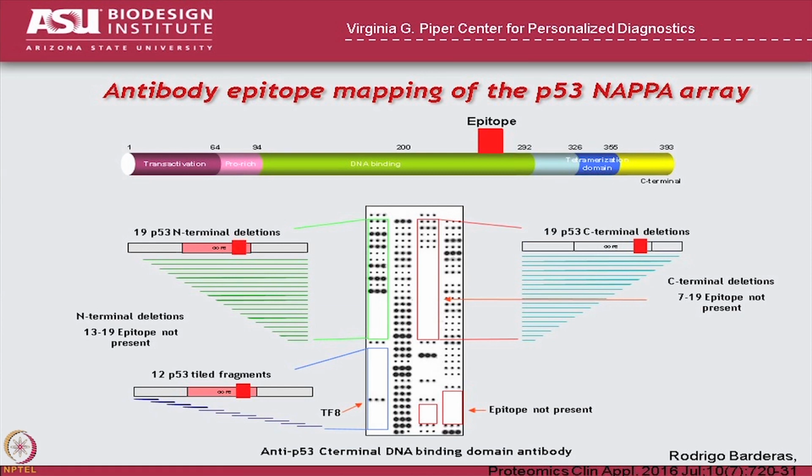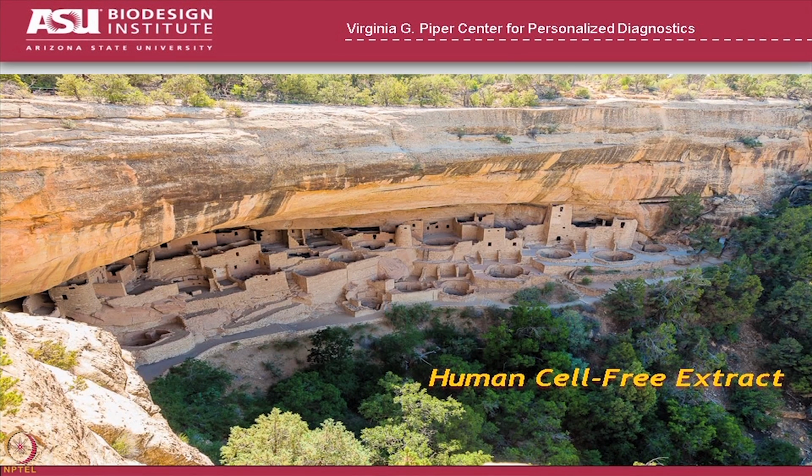We did C-terminal deletions, and again, it binds to here, and then you don't see it. And we did fragments that walk across the protein, and of course it binds to just that one there. So there's been a couple of advances that have occurred in the last, I would say, several years.